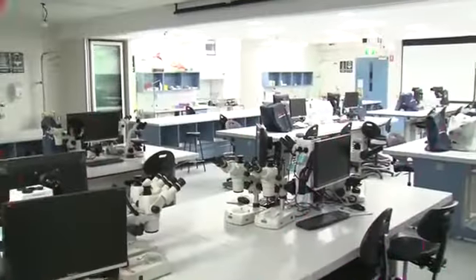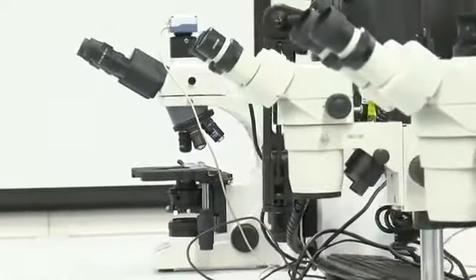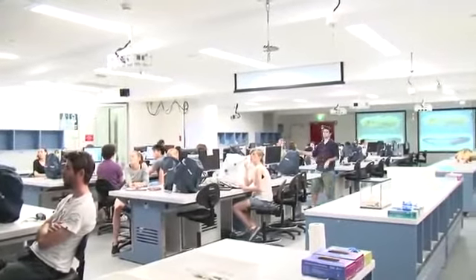Welcome to the Biology Digital Teaching Labs at Macquarie University. This short presentation provides a virtual tour of this highly interactive and stimulating learning environment that utilises the latest technologies while maintaining a sustainable outlook.